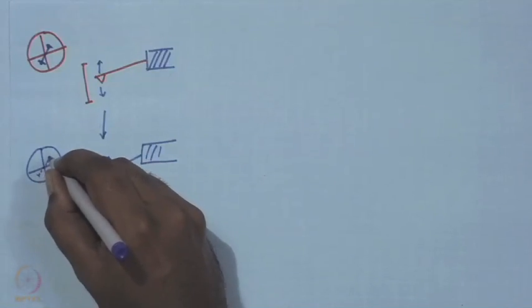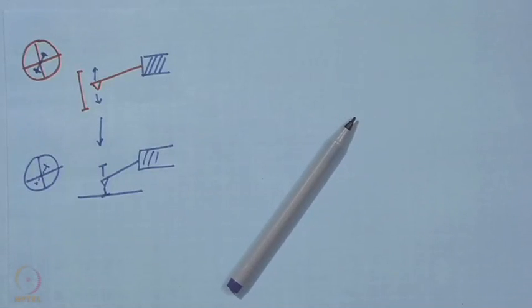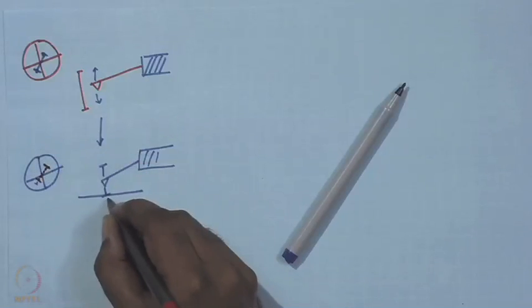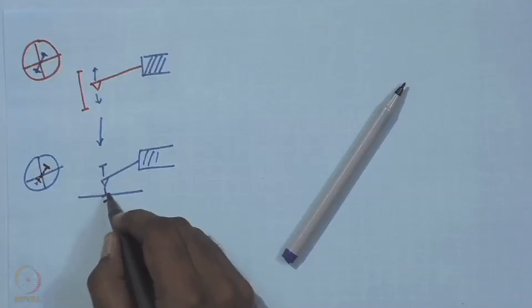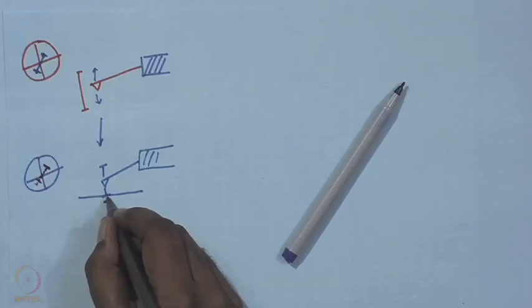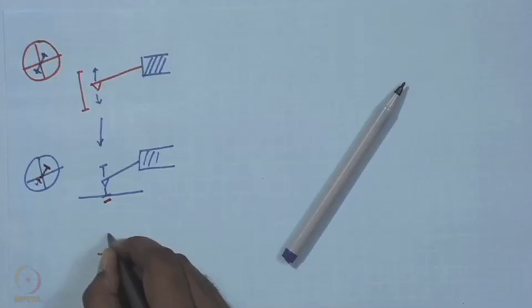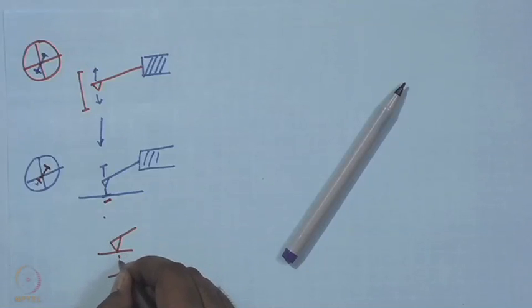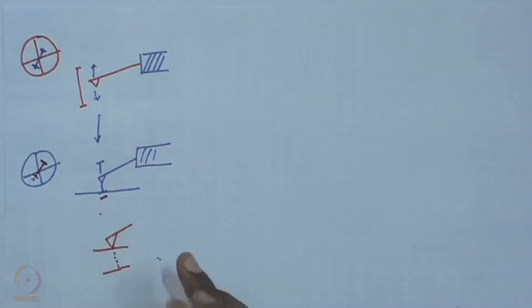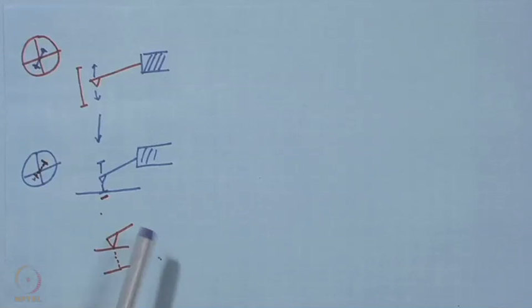if, let us say, this was the range corresponding to the free oscillation, the range now gets truncated because it can't go beyond this. Suppose this was the maximum up to which it should have gone because of its oscillation, but the surface has now come. I will draw a blown up picture. During the oscillation it touches here and fails to traverse this part of the oscillation because of the surface. So, instead what it does is it goes on tapping or knocking the surface like this, okay.